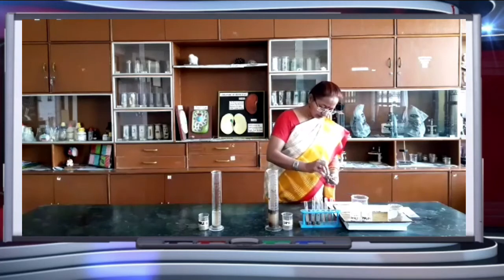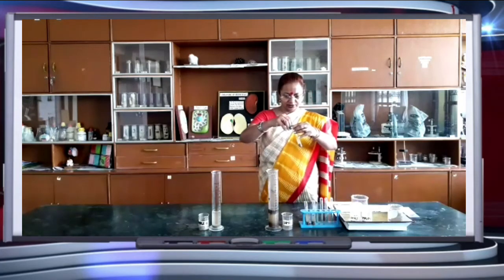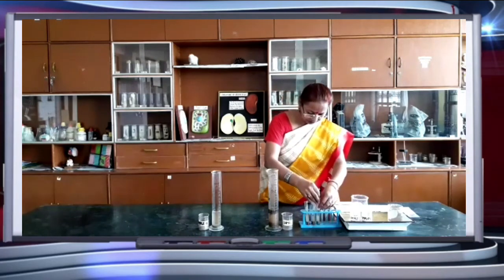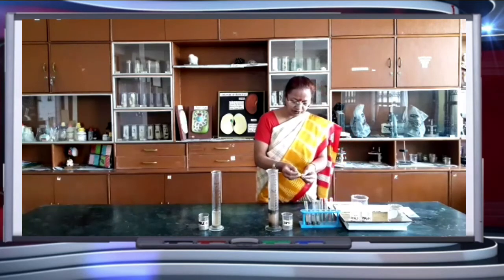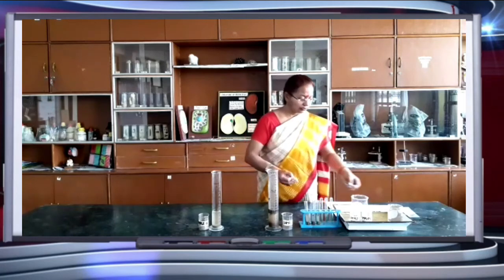And the third sample, let's check this also. This is sandy soil, which I have in sample 3 test tube. And this also is the same as 7. So this is how we can check the pH value of soil, right?